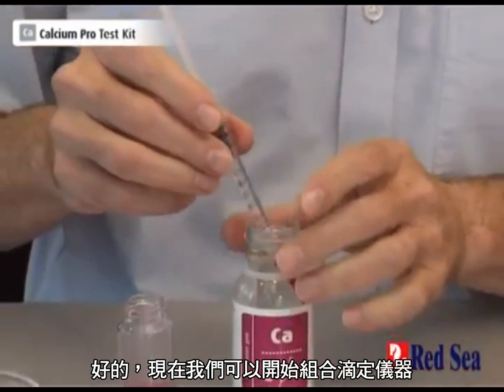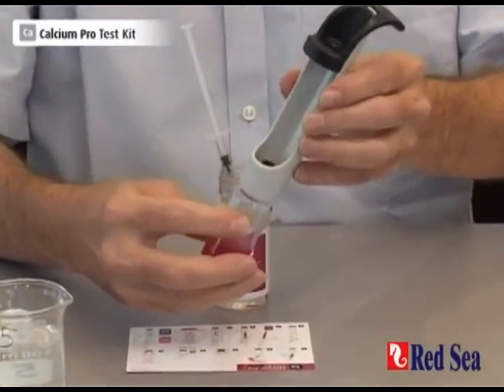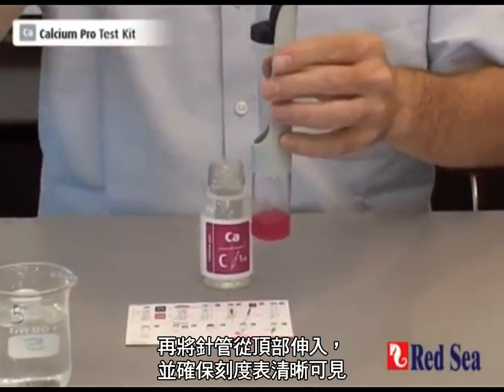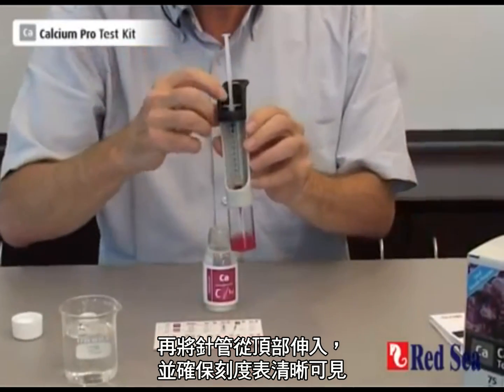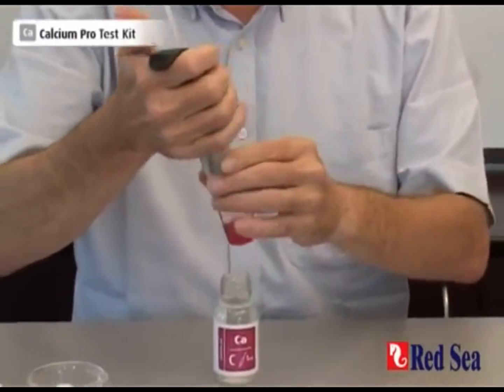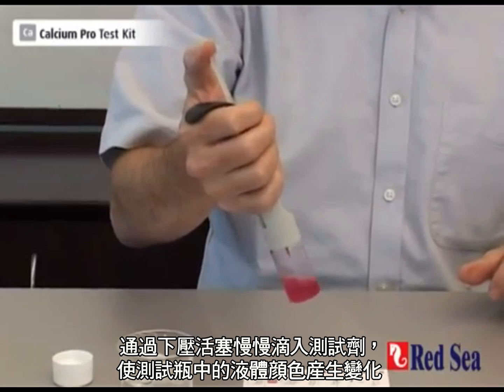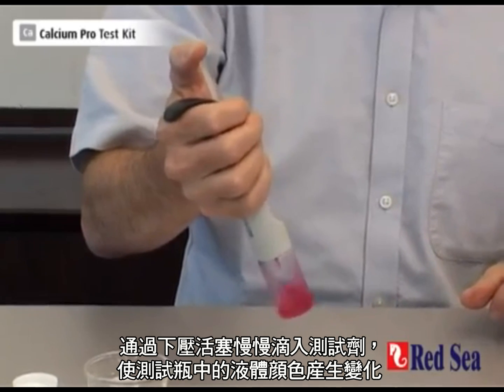Now we can assemble our titrator. We screw the vial onto the bottom and insert our syringe into the top, making sure that the scale is clearly visible. And now we start doing the titration by slowly adding the titrant, pushing down the plunger, and we wait for a color change to occur in the vial.